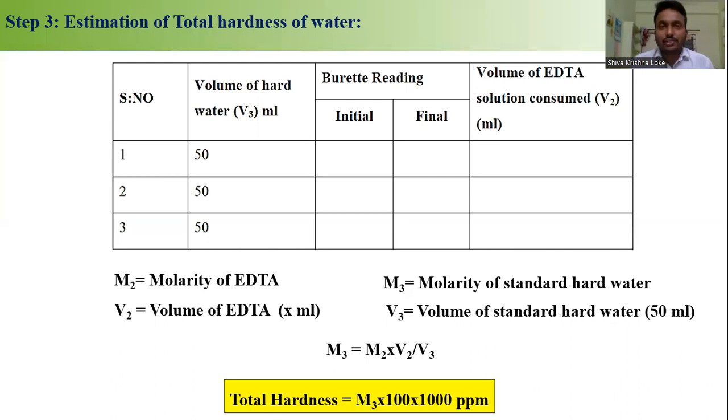For this session, I want to conclude with a few words. In this session, we have discussed what is meant by hardness. Hardness is due to the presence of chlorides, sulfates and nitrates of calcium and magnesium metal ions. Hardness is a property of water, and we determine this property with complexometric titrations. In these titrations, we use EDTA as a ligand. It's an organic molecule, but the solubility of organic molecules in aqueous media is very low, so we substitute 2 hydrogens with sodium and get the disodium salt of EDTA.